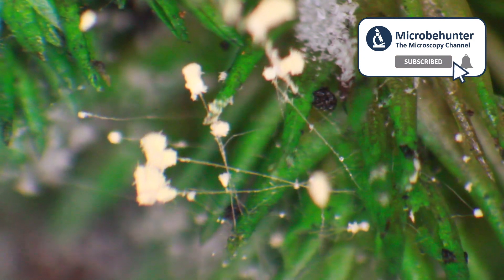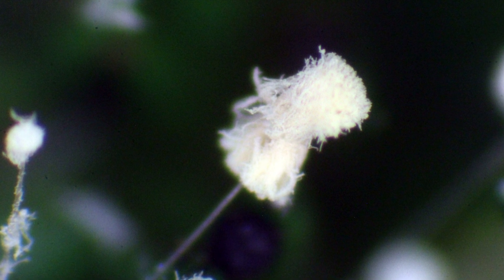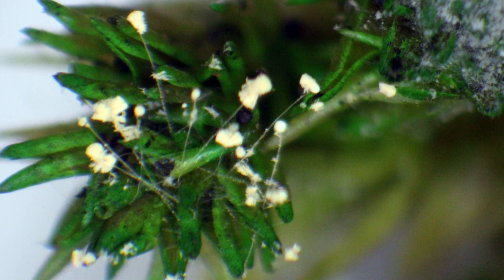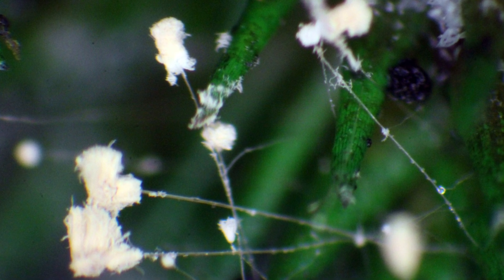I do not know if this is the same species of fungus or mold. But in any case, there seems to be quite a bit of diversity of contamination growing on the moss right now. In another picture, we again see the gray hyphae or mycelia of the fungus — that fuzzy part — which seems to be a sporangium that carries and forms the spores. We also found those black dots; we don't know what they are, but these could be soil particles that have accumulated on the moss. This is certainly a very bad thing to happen to the mesocosm, but that is the whole point of the experiment — to see if it's possible to keep a closed system over a longer time period.